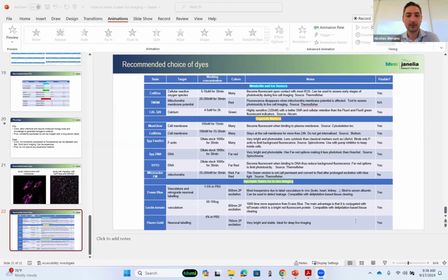And Nicholas, yes, I'm just going to jump in and say thank you for that. That was a really useful lecture, even for myself, and I like to think I have quite a lot of experience with dye selection. I completely agree that one of the challenges is that these dyes are often not very cheap. There's a sense that they're not very thermostable, and you don't know if they're going to work for your assay. So I think a community curated database of what works under what conditions and what cell lines is a brilliant idea. Let us know how we can help.